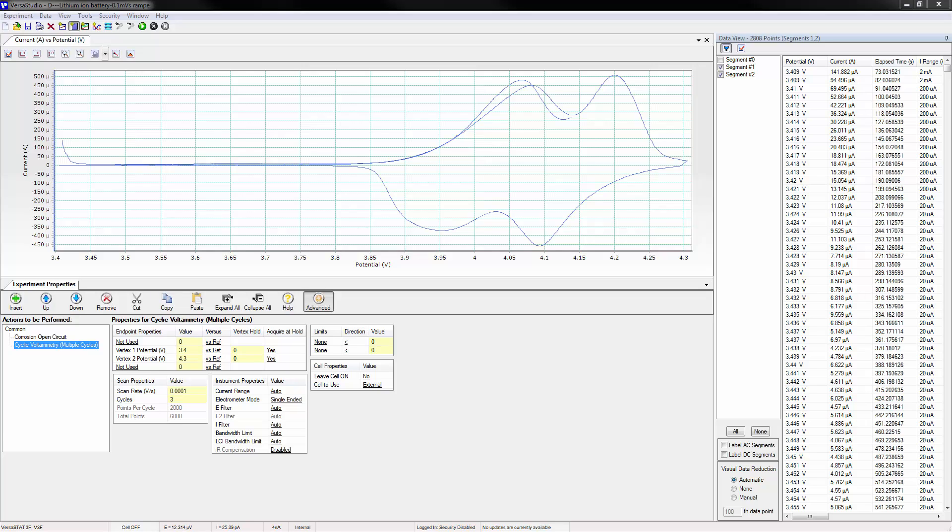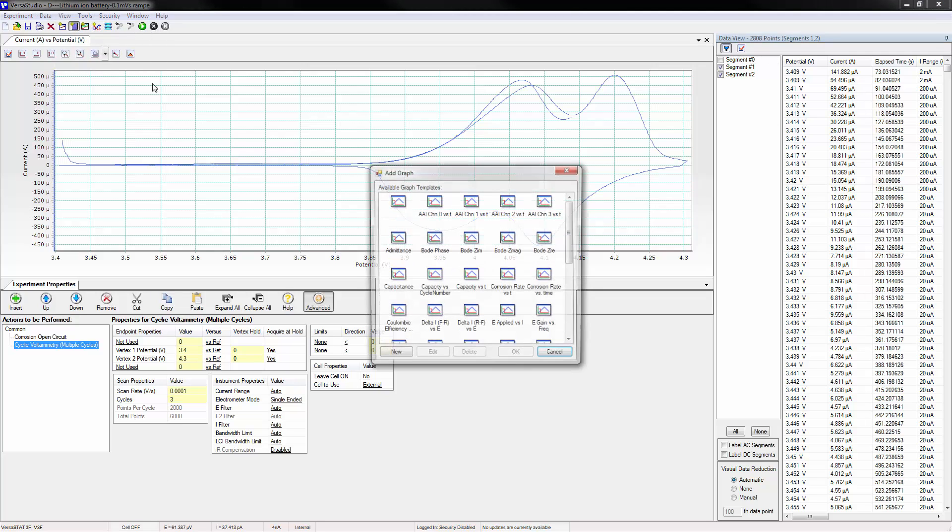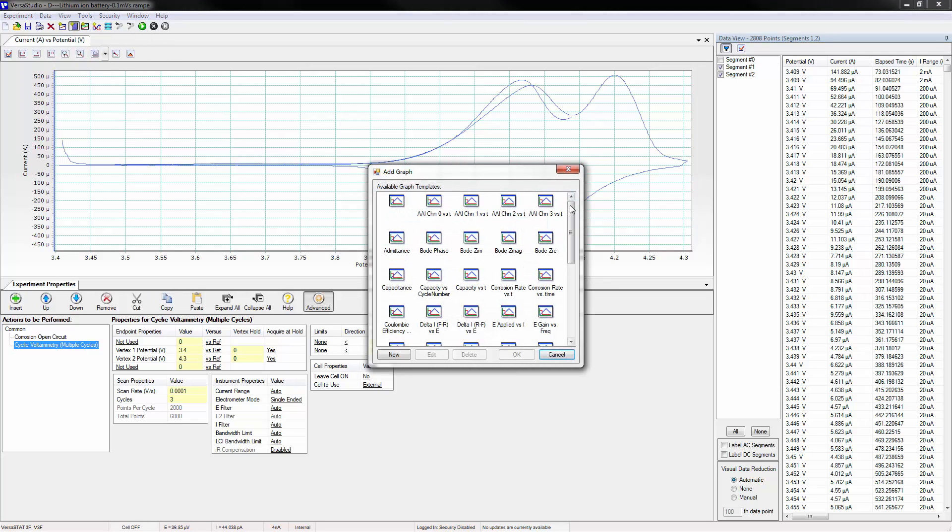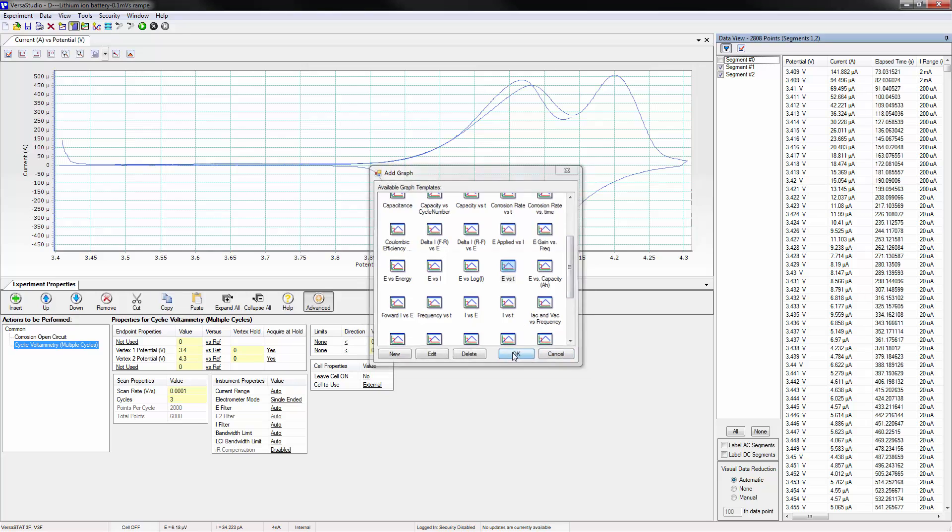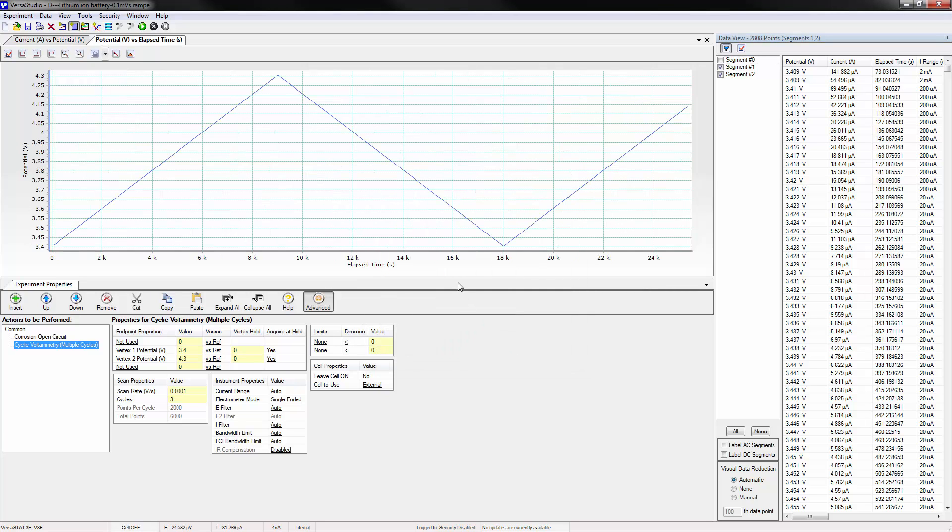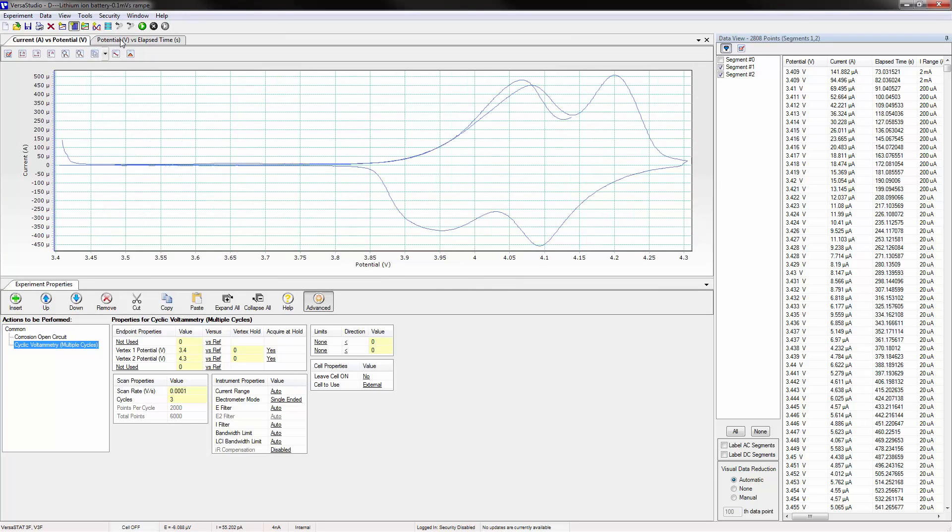This previously recorded data is presented here in the default layout used by VersaStudio. Adding a new graph defaults to a single graph window where each graph is accessible by clicking on its tab.